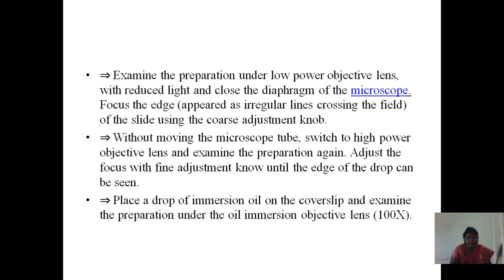Examine the preparation under the low power objective lens with reduced light and close the diaphragm of the microscope. Focus on the edge that appeared as irregular lines crossing the field of the slide using the coarse adjustment knob. Without moving the microscope tube, switch to the higher power objective lens and examine the preparation again. Adjust the focus with the fine adjustment knob until the edge of the drop can be seen. Place a drop of immersion oil on the coverslip and examine the preparation under the oil immersion objective lens at 100x magnification.